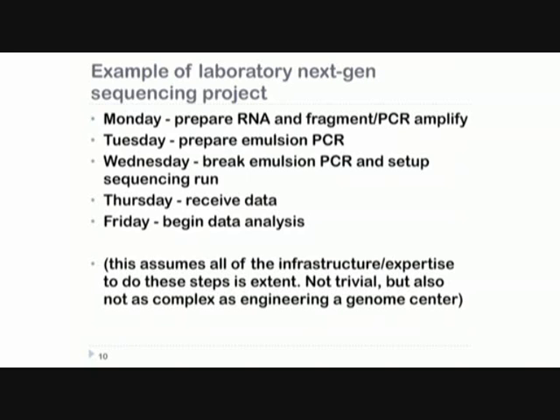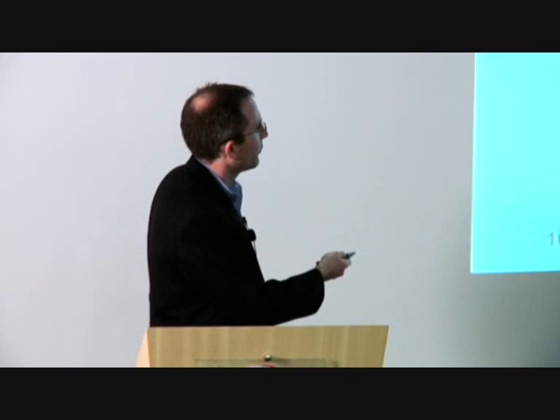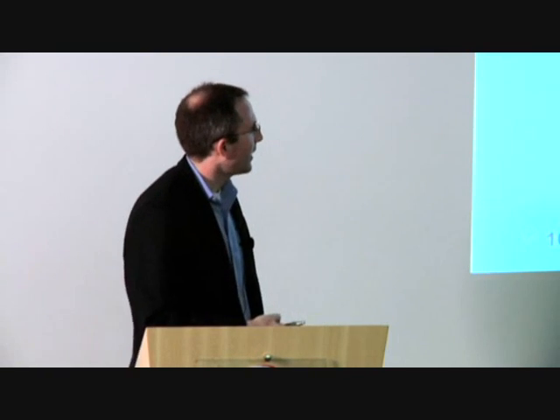You can see from this example workflow how having this sort of access in a laboratory can change the way that you think about sequencing projects. We can think about a project over the weekend, start it on Monday, and have our data by Friday. It's empowering to be able to generate this sort of data so quickly, assuming, of course, that you've already put in the energy to build up the infrastructure necessary to acquire this sort of data.